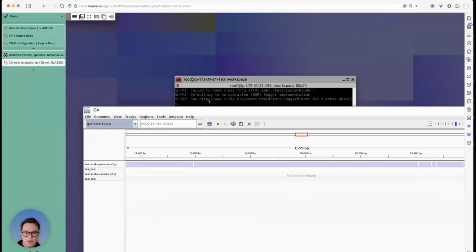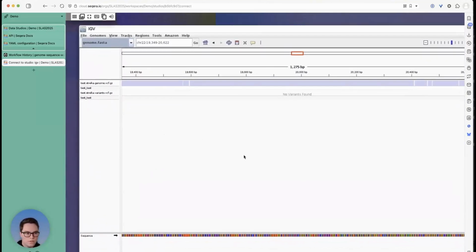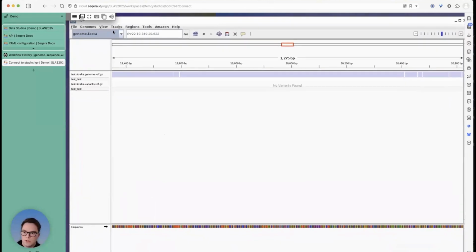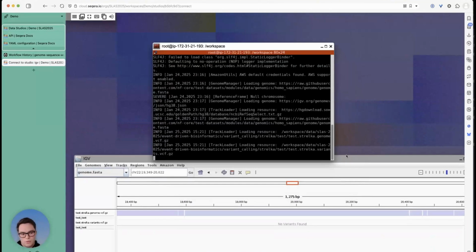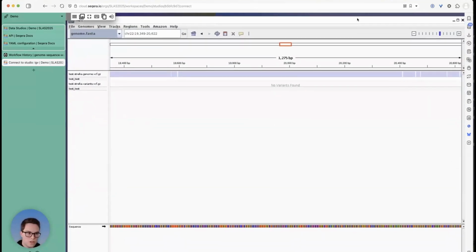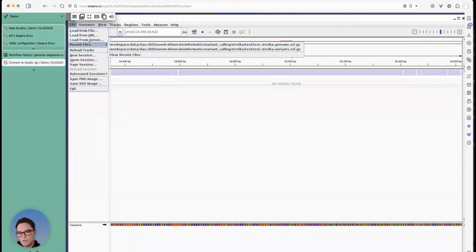This is just an X environment that we have loaded up with the IGV genome browser. It's just a terminal interface, and you're logged into this EC2 instance here. I think that's pretty cool and powerful for users, because instead of working back and forth between your laptop and various other things, while IGV may not be very difficult compute-wise, it can be difficult to set up, and you can just pull those in from that.